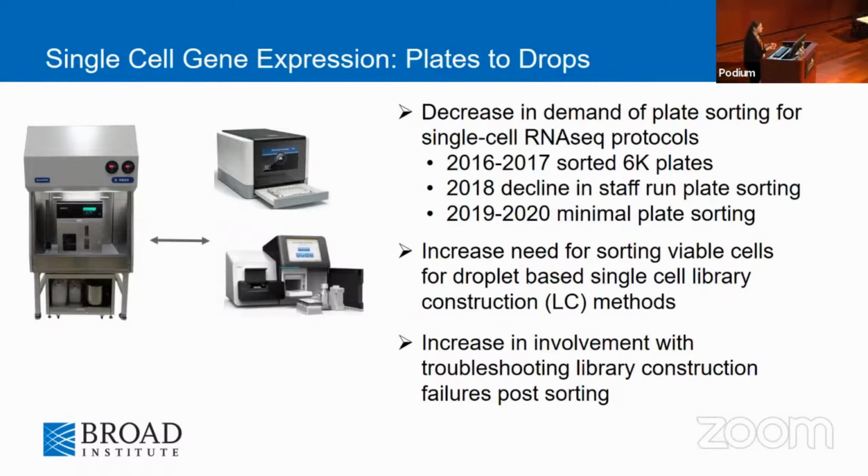There are certain points in the method for single cell, especially in 10x, where if you do something incorrectly, like adding the buffers at the wrong time, then you can burst your cells open, right? So if you add the water to the cells before adding the water to the master mix, that's it. You've just ruined your whole 10x experiment, and you might not have realized it. So you might get the data back and it looks like all junk, like a lot of mitochondrial reads or something crazy. But if you know the workflow, then you can better understand how to help people too.